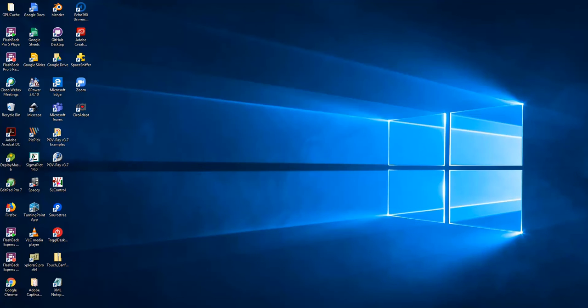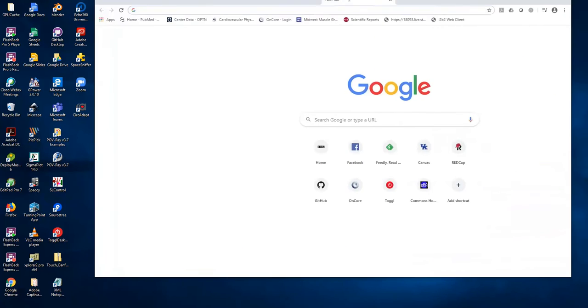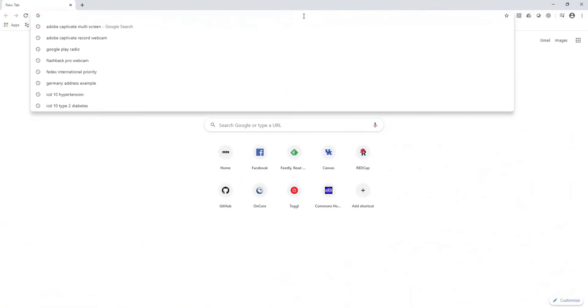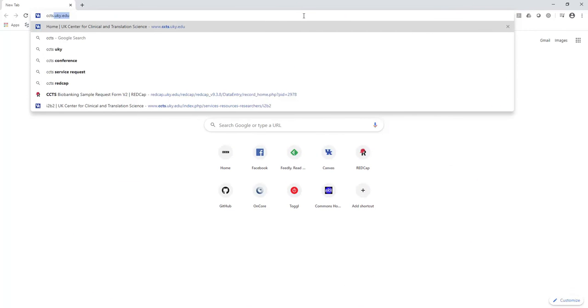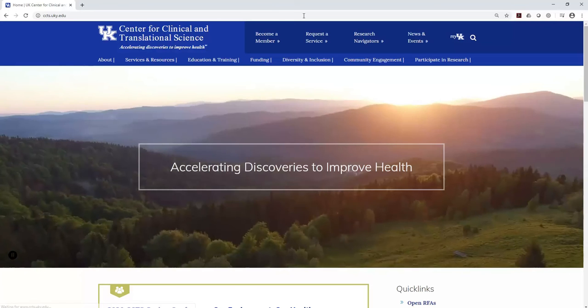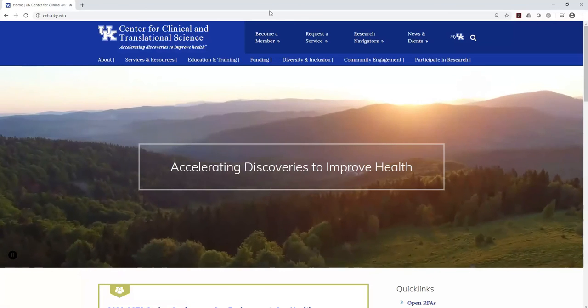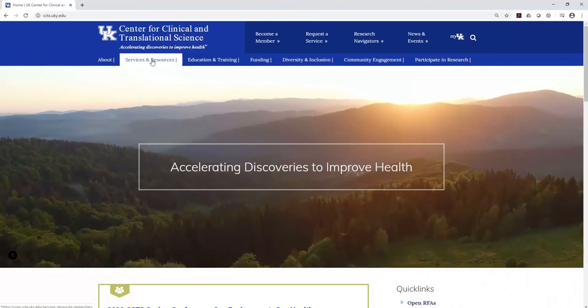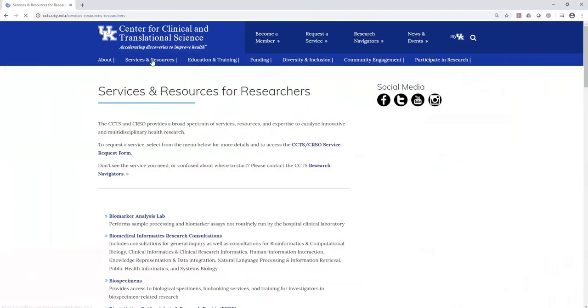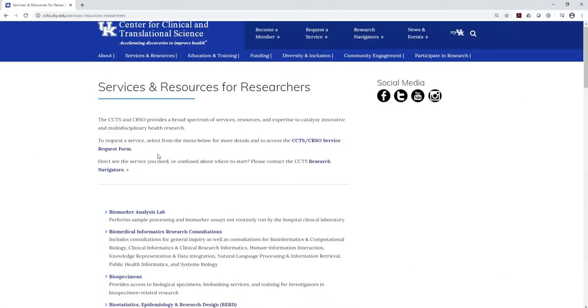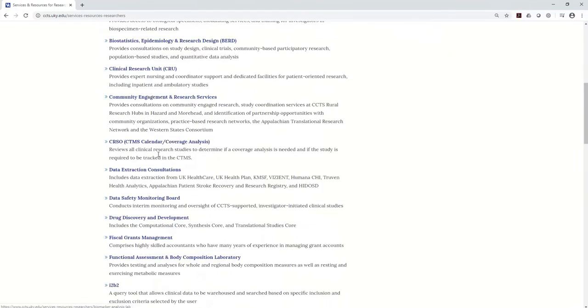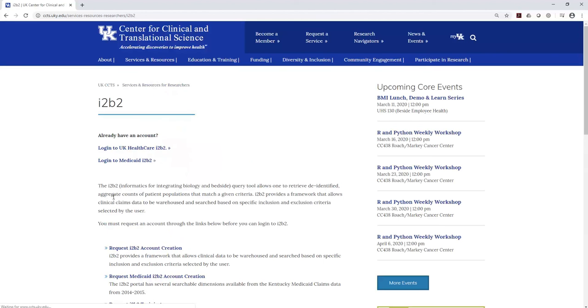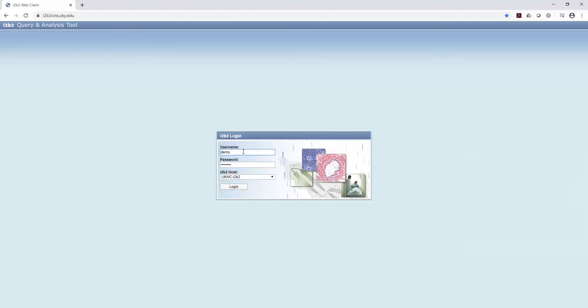Okay, so the first thing you want to do is open up your web browser. So I'll pull up Chrome here, and you want to go to ccts.uky.edu. Now if you click on Services and Resources, and you scroll down, you'll see I2B2.